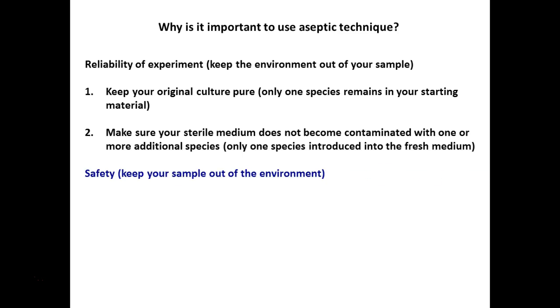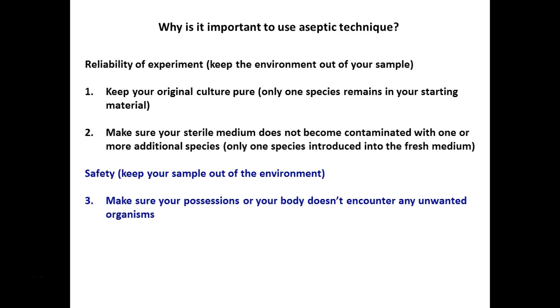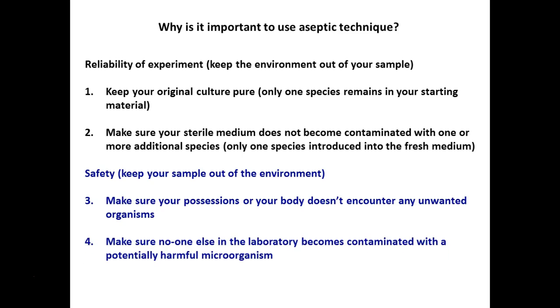Safety. We want to keep these organisms out of the environment. Even though these are non-pathogens, right, they could, for some people, under some circumstances, create problems, right? Any large number of microorganisms could be a problem, right, which we're going to propagate to large numbers. So we don't want our possessions exposed. That's why we stow them away, right, why we wear protective gear. And to make sure anyone else who uses the laboratory isn't exposed to anything, right? We clean up after ourselves. This is the cleanest lab on campus. Literally the cleanest lab on campus. Because at times it's the dirtiest lab on campus.